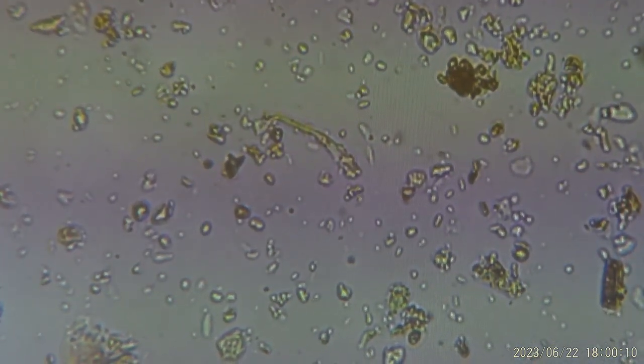A few things that I wanted to talk about on this particular slide are these little microaggregates. These microaggregates can only form if we actually have the microbes present. These are fungi and bacteria that create glues. These are the things that are going to hold your soil together. The more of those microaggregates you have, the more water stable compounds will form in the soil. Your nutrients will stay in the soil, less leaching, similarly with water as well. So whenever you're looking under your microscope, that is one thing that you want to be seeing.